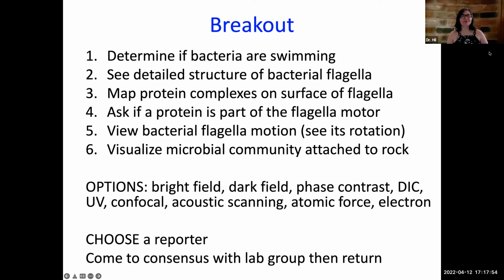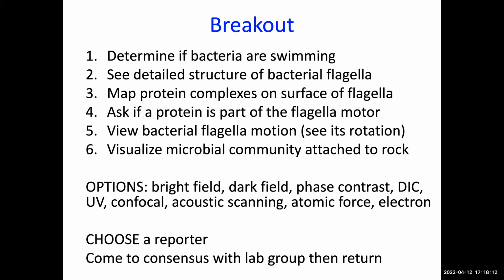Sarah, go ahead. I thought it would maybe be a bright field microscope, because the specimen is able to be alive and able to move around when you're looking at it. So that's what I was thinking. Great. Does anyone have anything else that they want to add? I know that there was one other group that did this one.